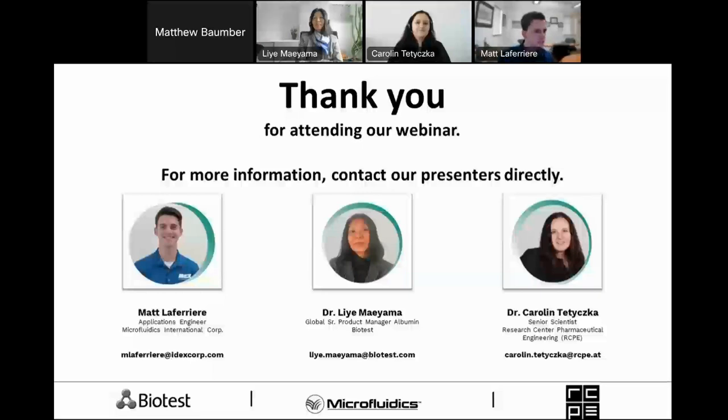I believe so for now. If not, we can always get back to them. But yeah, for now, we'll continue moving on. We have a couple more. So one question that we have is, which is the best method to remove chloroform, either TFF or rota evaporation? I would say both are quite suitable. Usually in literature, they use rotary evaporation, but I think also TFF can be used.